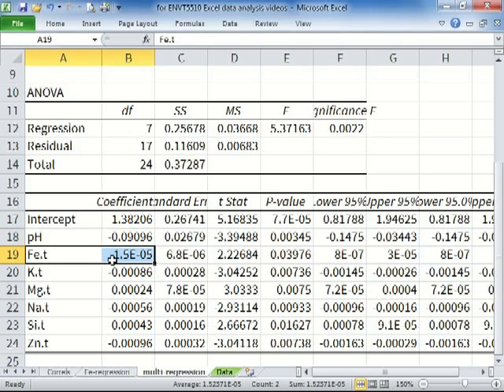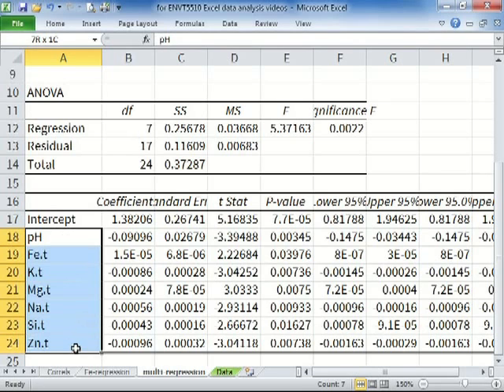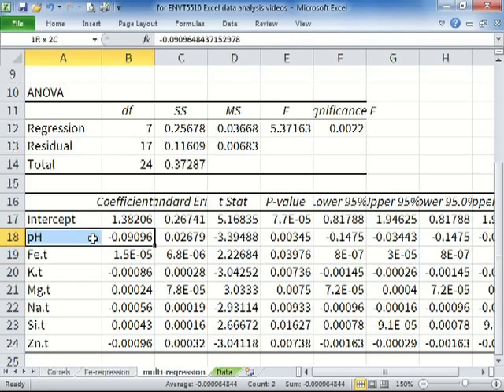We've now got a positive coefficient, albeit a fairly small one, for iron, so maybe iron is not that important when we have a multiple regression model. Of course, it's a bit of an art because it depends on the initial list of predictors that we put in. So obviously iron by itself wasn't a bad predictor, it was the best of the lot. But in combination it has less of an effect. Alright, so pH actually has the largest effect, judging by the size of its coefficient, which makes sense.